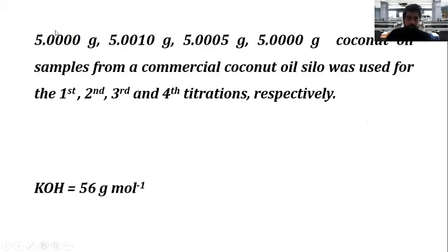I use this calculation to explain this to you. So please record these things. I have done four titrations. For the first titration, I took 5.000 gram.